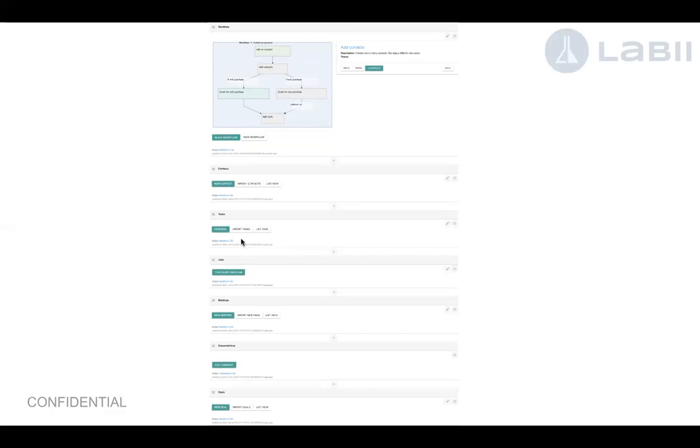What are the tasks you need to do for this particular customer? Do you need to follow up? Do you need to finish the invoice? That can just be created inside the task. What are the jobs associated with it? For example, to finish some kind of notes.